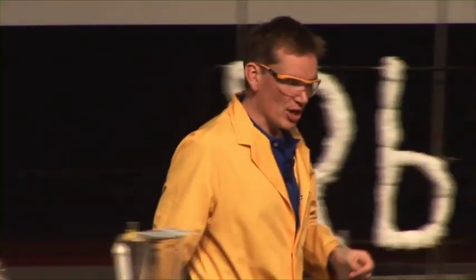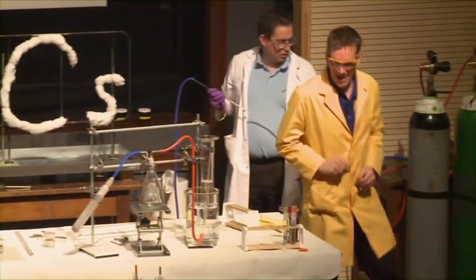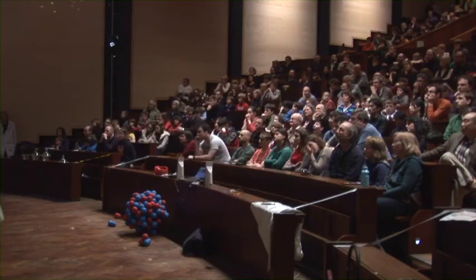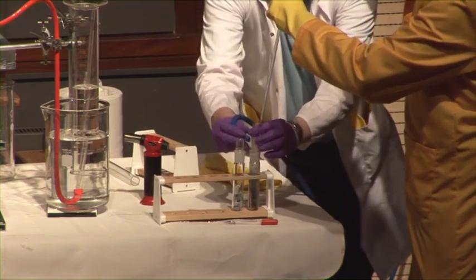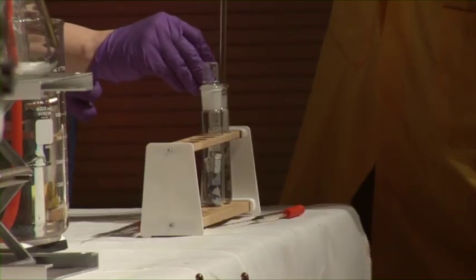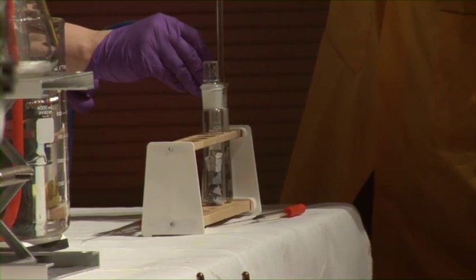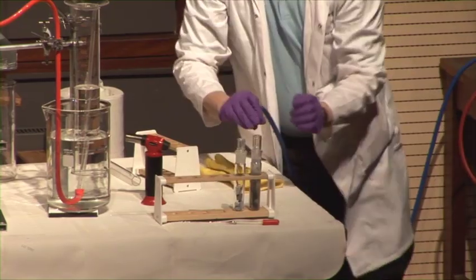Now, in order to do this, I'm going to use the liquid metal that we made at the beginning of the lecture. This is the mixture of sodium and potassium — the alloy that we have in the tube here. We're just going to open this under argon. Now I have a tube full of liquid metal.